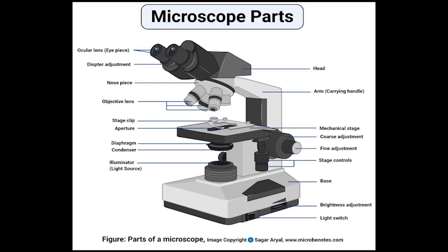The question is, what is a photograph? A photograph taken through a light microscope is called photomicrograph or light micrograph.